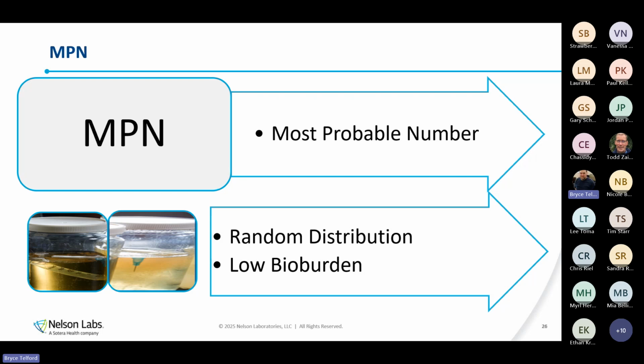Our volume-based correction factor of 3 becomes a limit of detection, which, and I have some examples, typically is reported out, for example, as less than 3. Well, if I have a product that I need to get a very low dose for, that limit of detection can become problematic. So if I have less than 3 for aerobic, I have less than 3 for fungal, I add those together, I now have less than 6, and yet I've actually seen no microorganisms. So that limit of detection can become problematic. So one of the ways that we can solve that is with a more sensitive test.